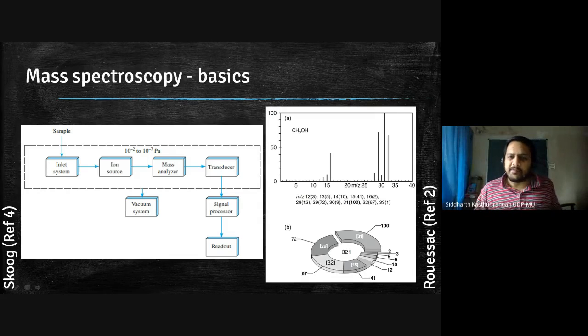The aim of mass spectroscopy, as far as this particular activity is concerned, is only to confirm the molecular mass, so that you can fix the molecular structure. For example, if I find that in IR the alcohol bands are present, and in NMR alkane type bands are present, then I know this is a normal alcohol, but I still don't know whether it is methyl alcohol, ethyl alcohol, propanol, isopropanol, etc.